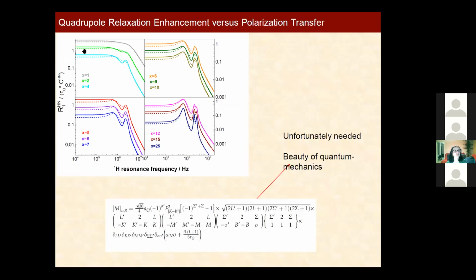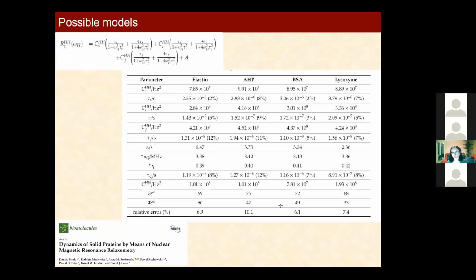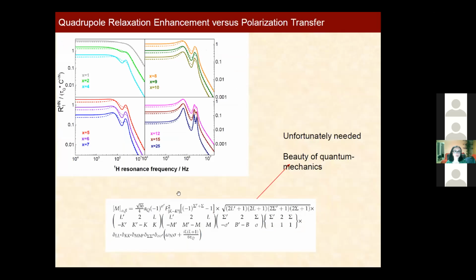And here you have a comparison between the predictions of that equation and the predictions of the quadrupole relaxation enhancement based on fancy calculations, using the stochastic Liouville equation.